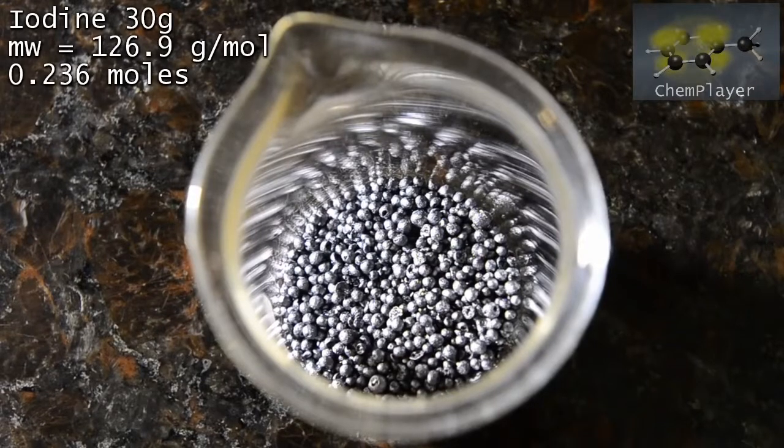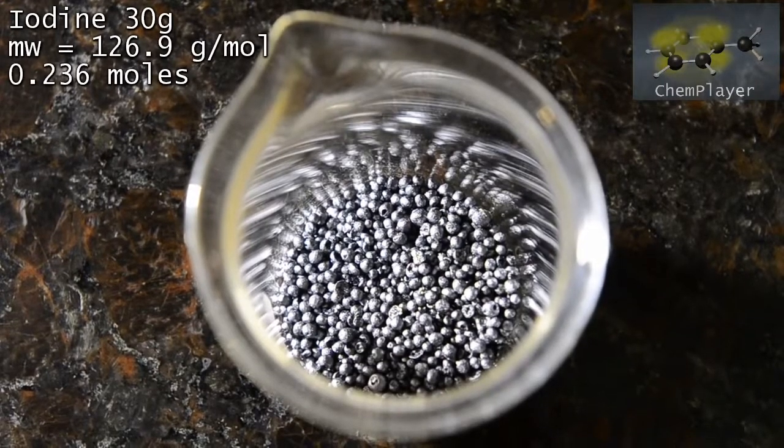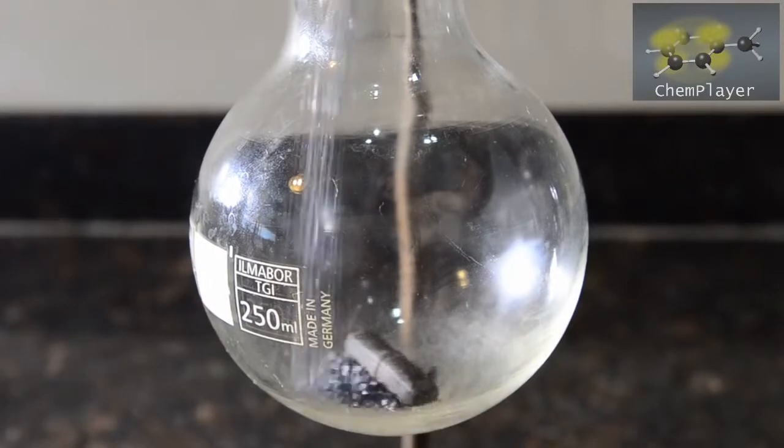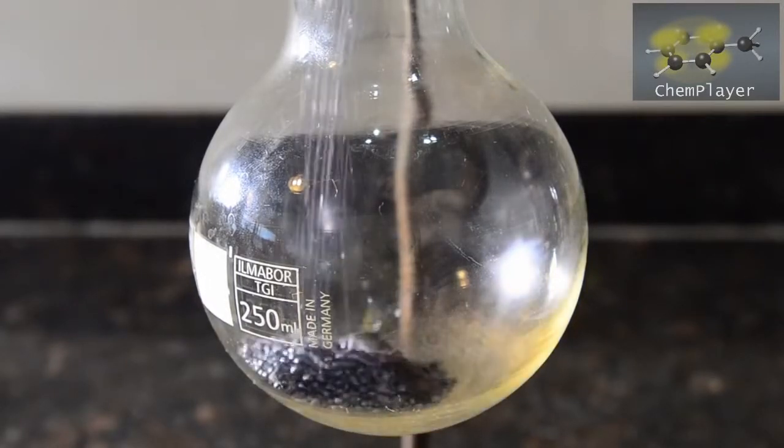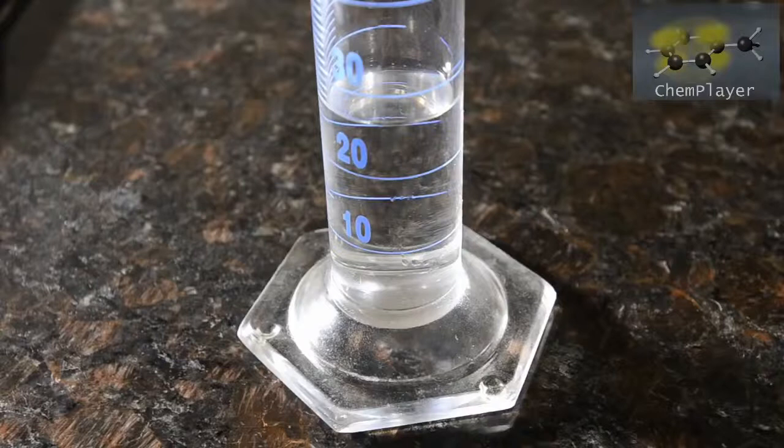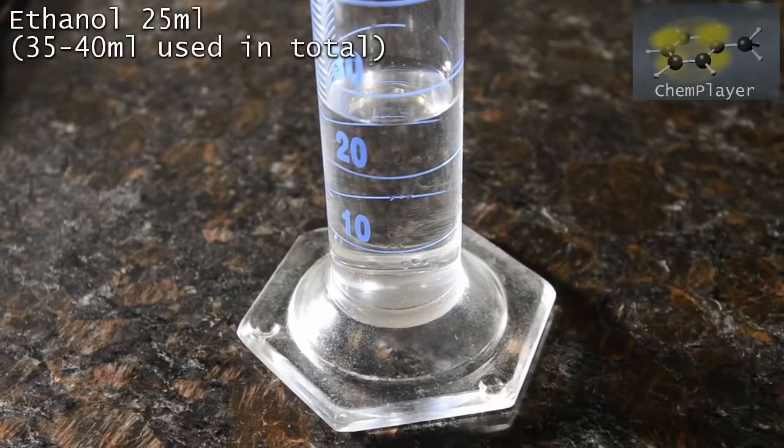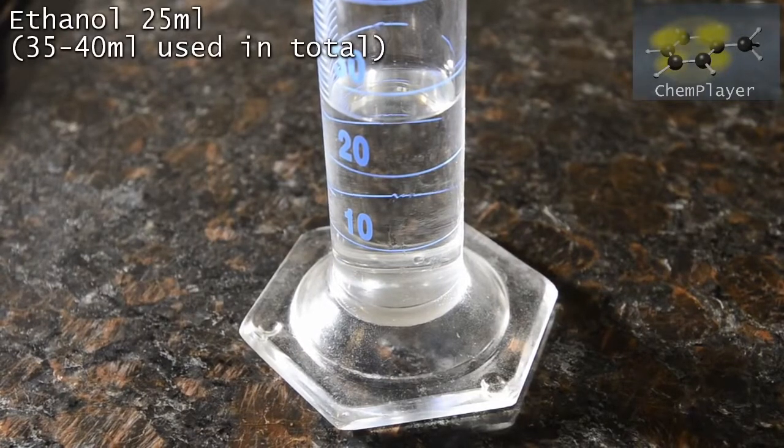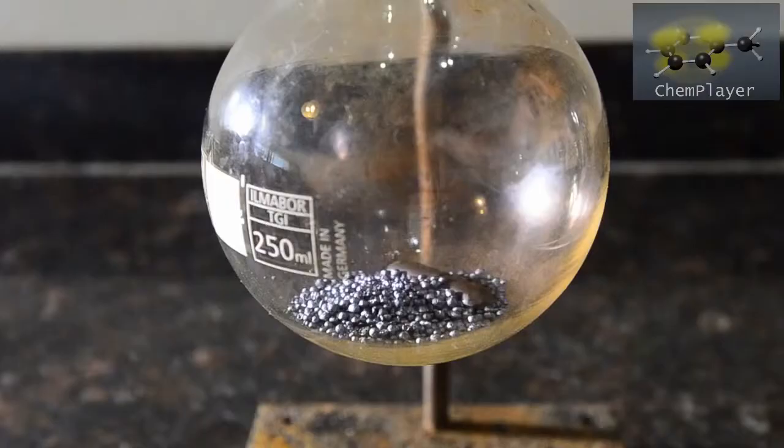We're starting with 30 grams of solid iodine, placing it in a dry 250ml flask equipped with a magnetic stir bar. We're going to start off with 25ml of ethanol to see how this goes. The stoichiometric amount we need for the reaction is about 14ml, but we'll use an excess. Let's get this into the flask.